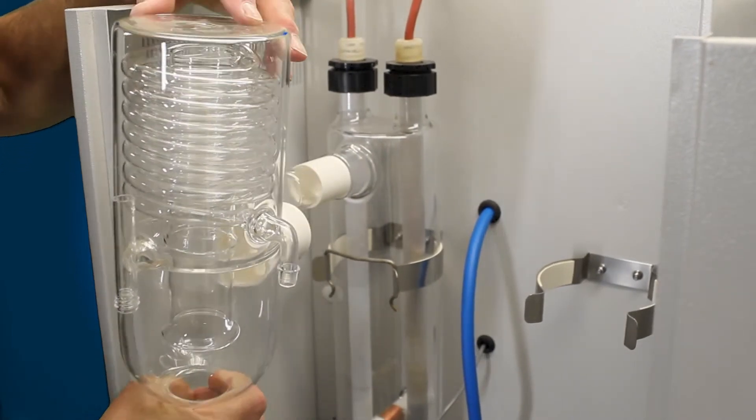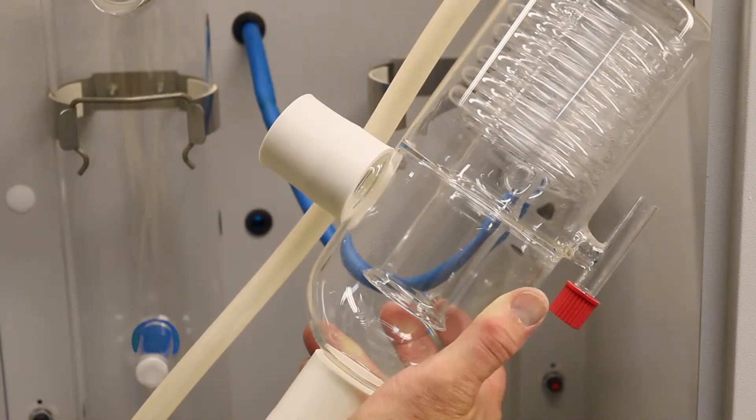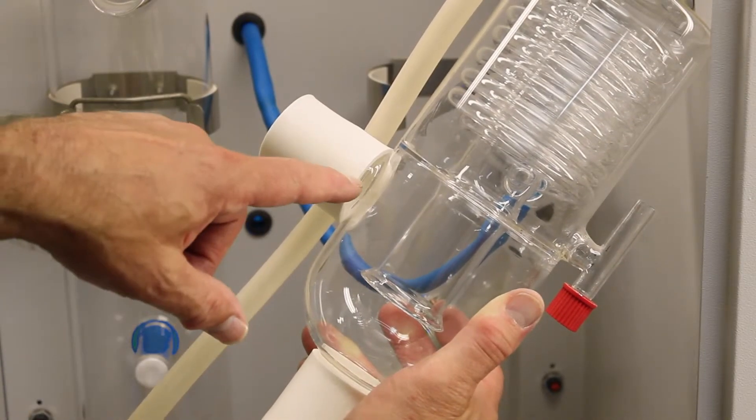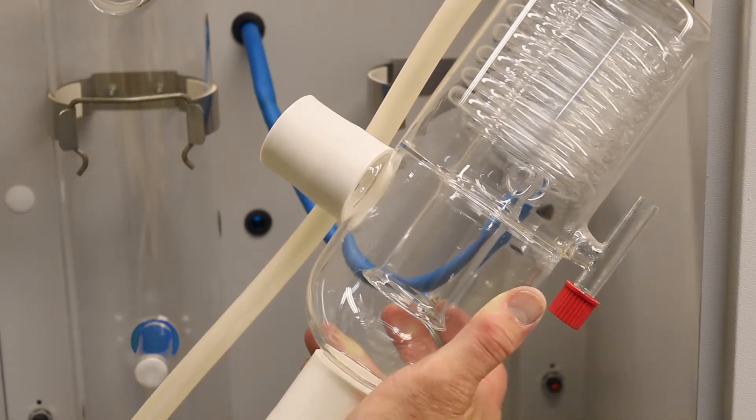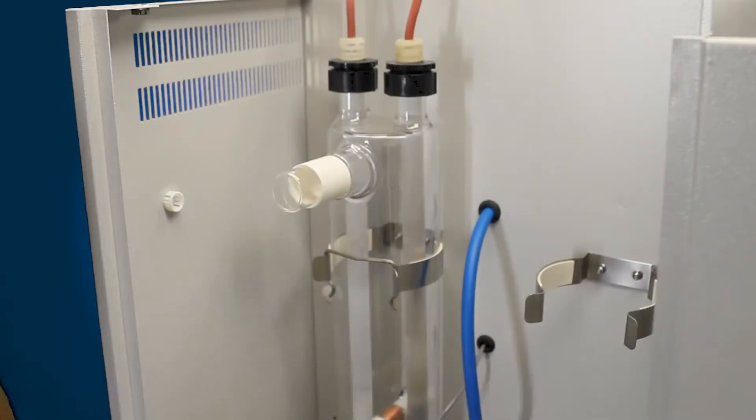Simply pull out on the condenser. The sleeve comes with it. You're going to remove the old sleeve. Again, if you can't get the sleeve to come off that way, you're going to have to cut it lengthways. Got your old condenser. Set that aside.